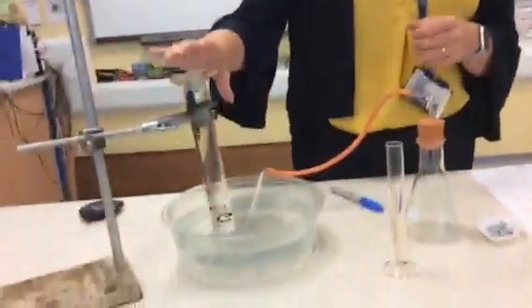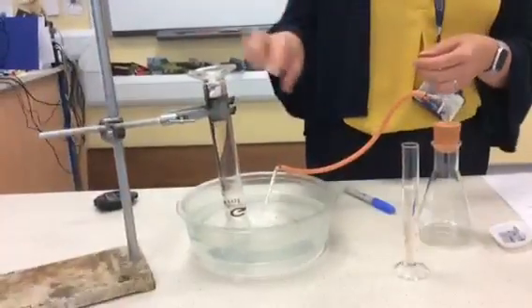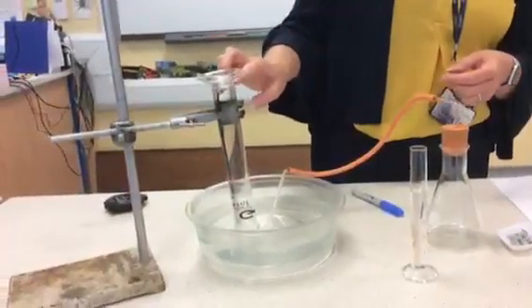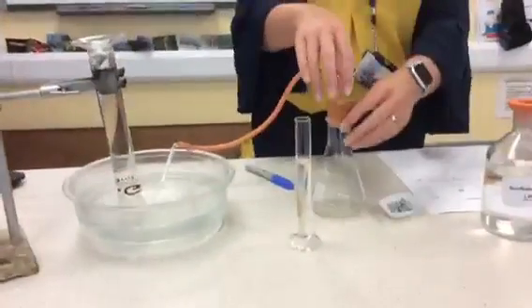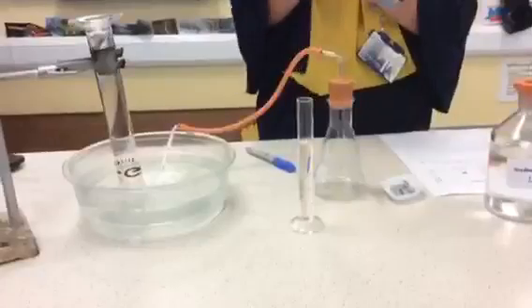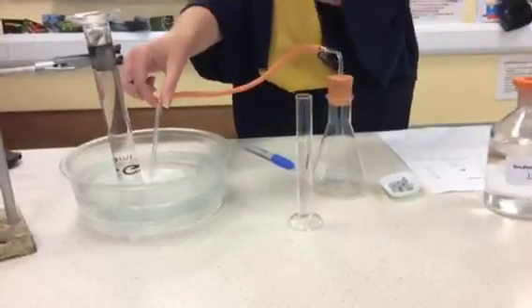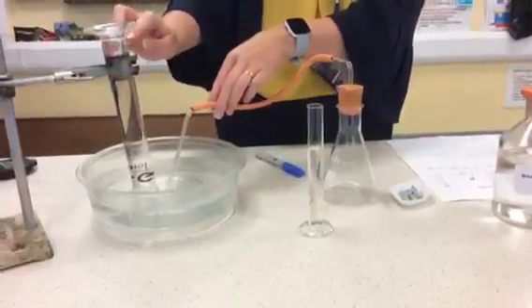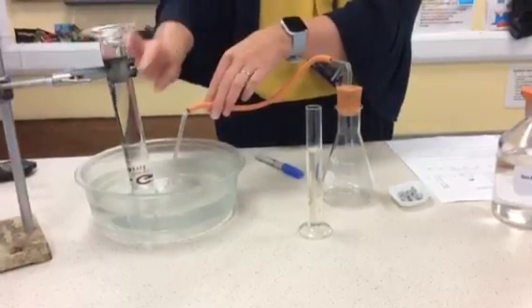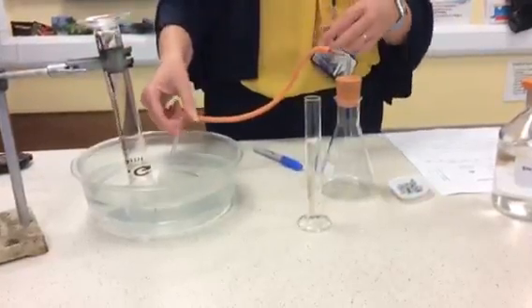So our hydrogen gas we're going to collect in our measuring cylinder here. We've got a measuring cylinder turned upside down and it's filled with water, so our water level is up at the top here. We're going to react the acid and the zinc in the conical flask, and then hopefully our hydrogen should travel through the delivery tube into our measuring cylinder, and as we produce the hydrogen gas, the water should be displaced from our measuring cylinder, and then we can measure the volume of gas that's produced.